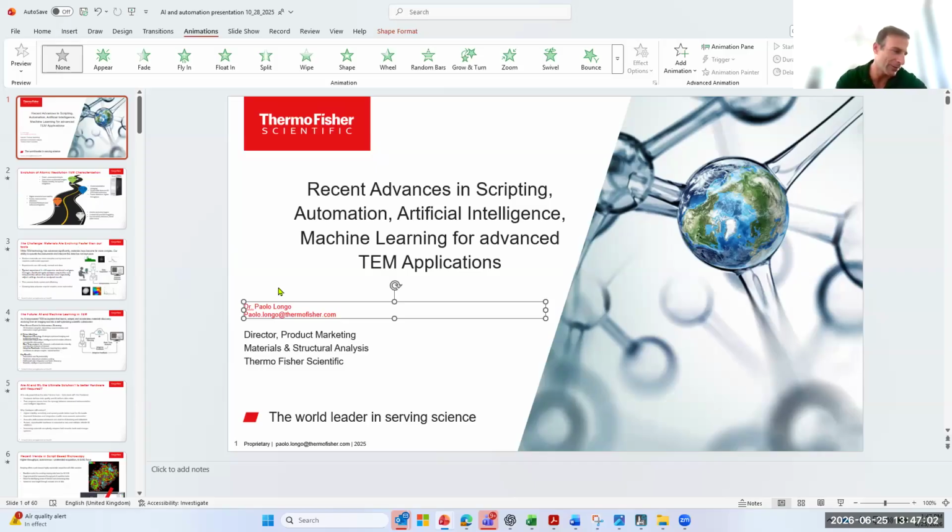And there are some barriers built within AutoScript. For example, you cannot tilt the stage indefinitely. So there are some barriers there. And actually, when AutoScript started, there were more barriers that were trying to ease this barrier. But I want to make sure that you cannot damage the microscope as a result of scripting.